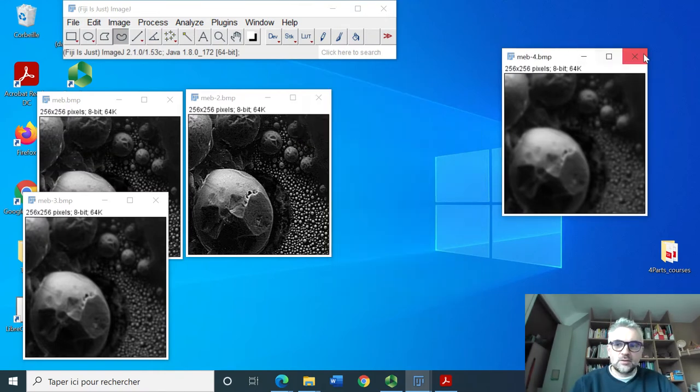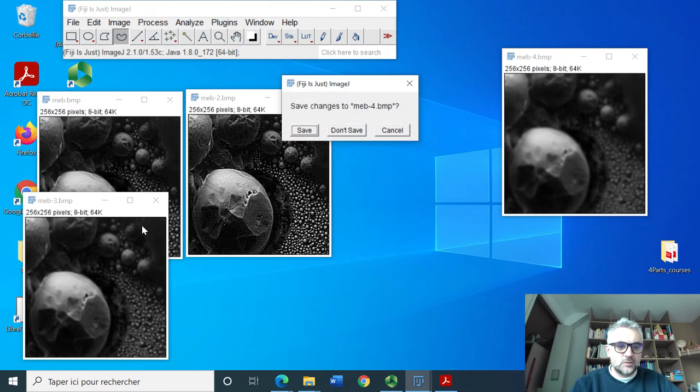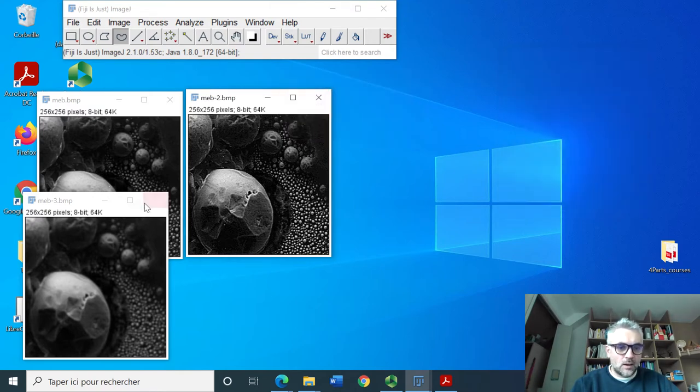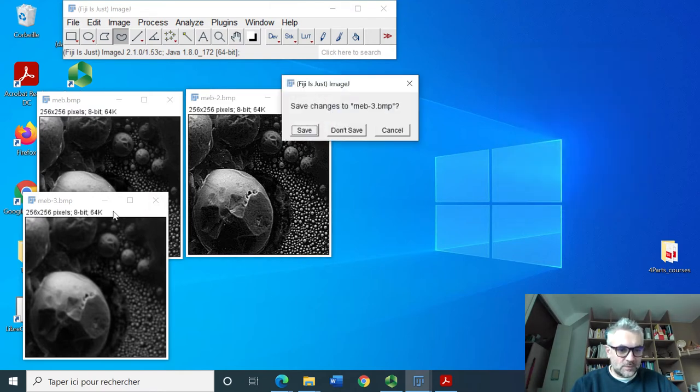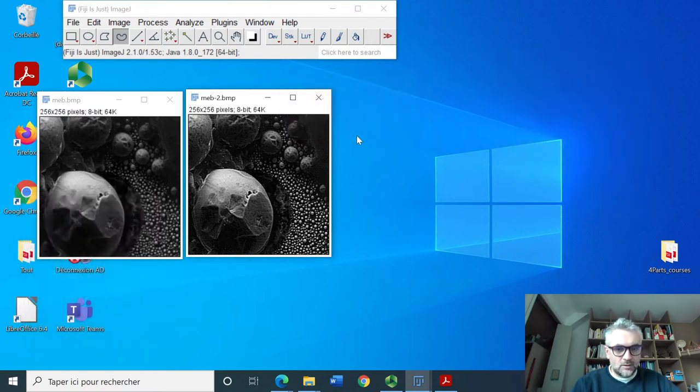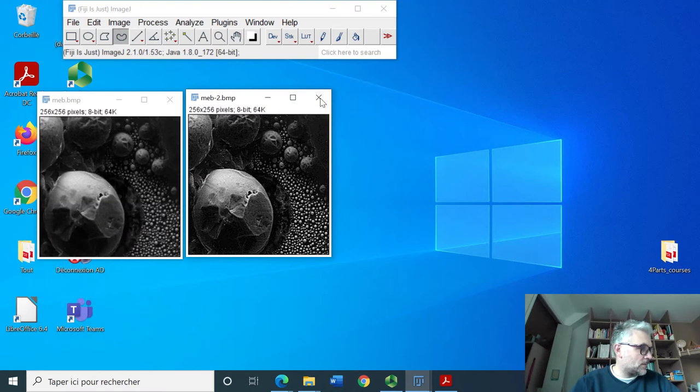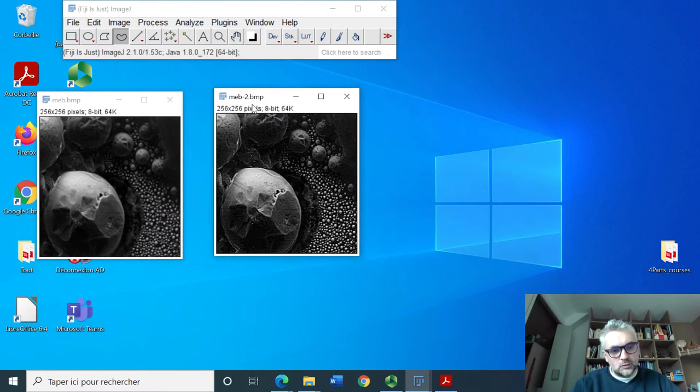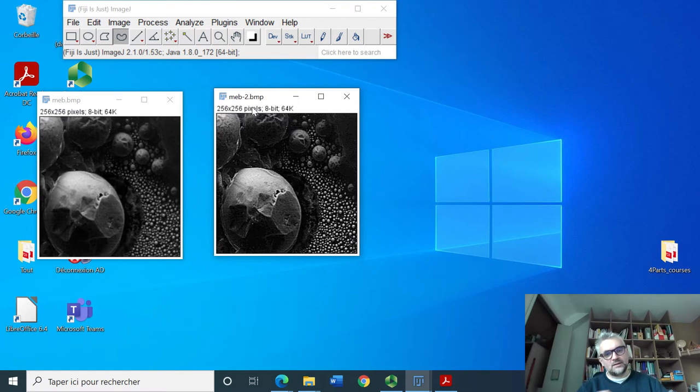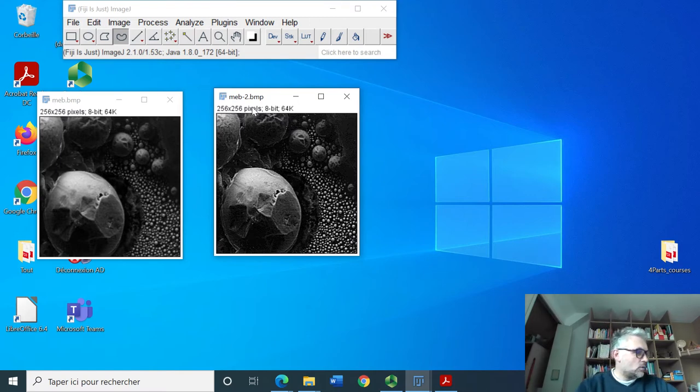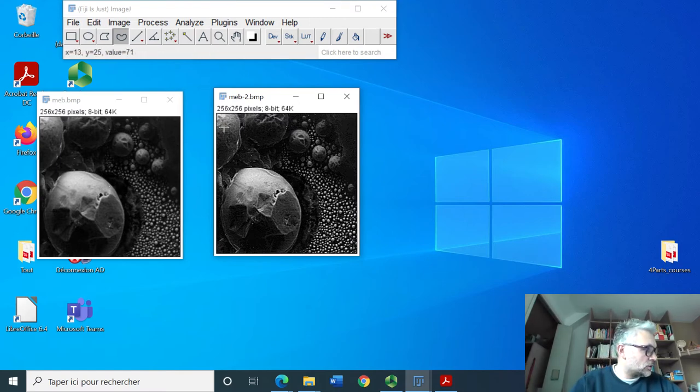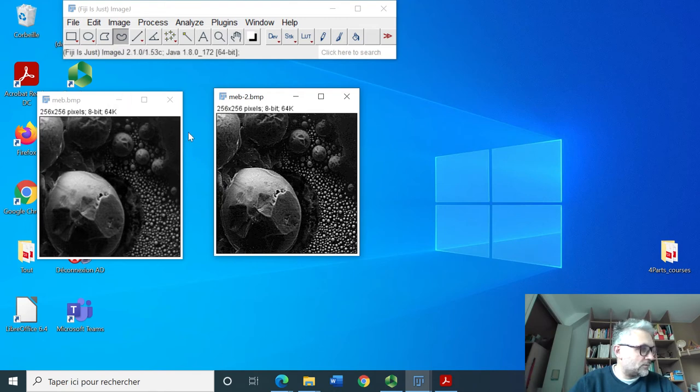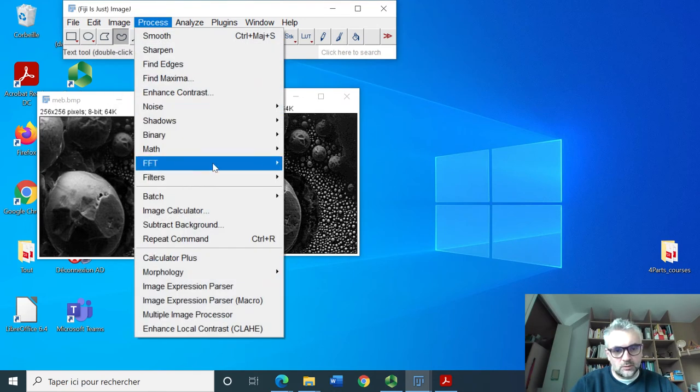Histogram is maybe not the best tool to compare what has been done on each of these filters. To be able to understand what's the difference, what we are proposed to do in question number four is to calculate the difference between original and filtered image.